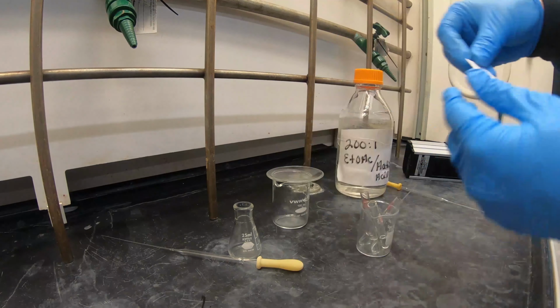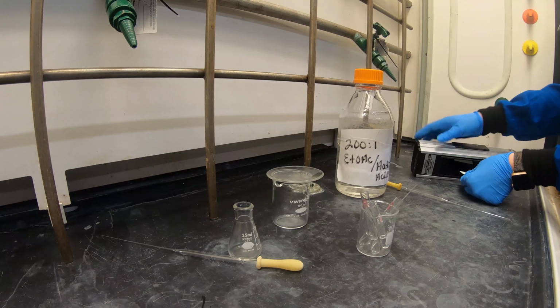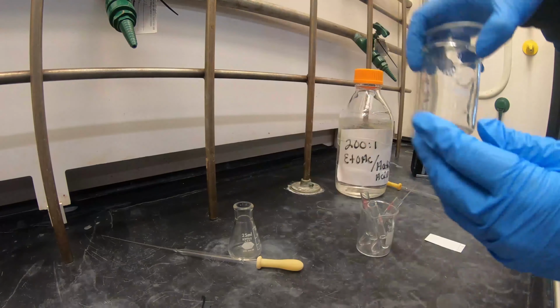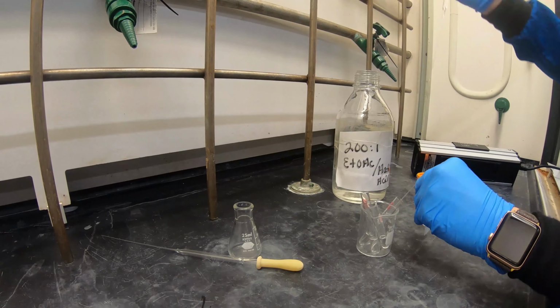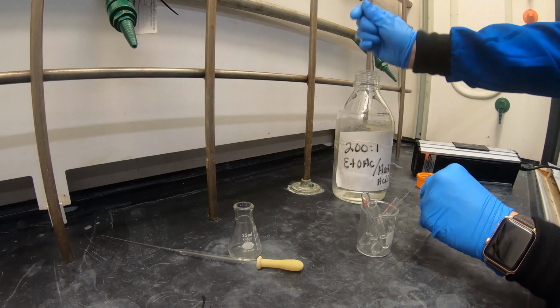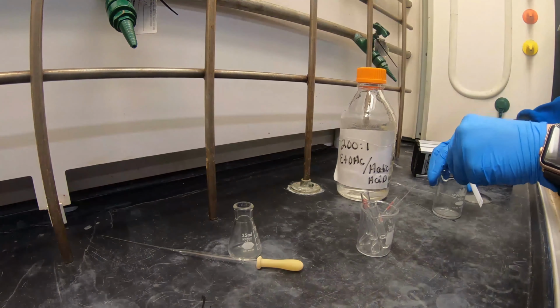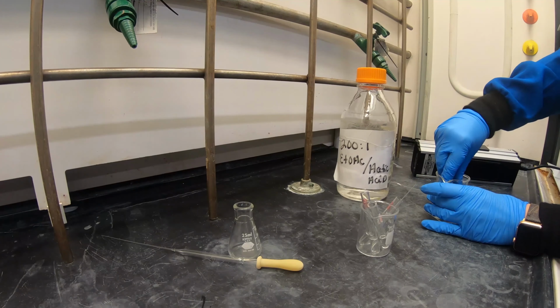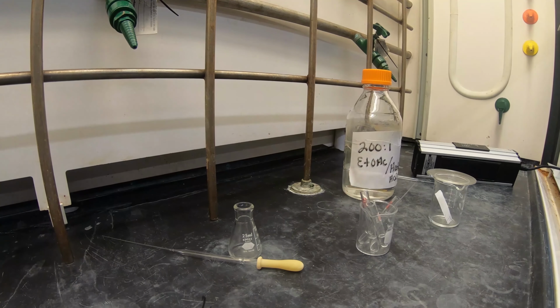Put the TLC plate under the light to check that you have enough sample loaded onto the TLC plate. Then add your eluent to the 100 ml beaker. You are using 200 to 1 ethyl acetate to acetic acid. The solvent in the beaker should be below the baseline of the TLC plate. Place the TLC plate in the beaker, making sure the sides are not touching the edge of the beaker.